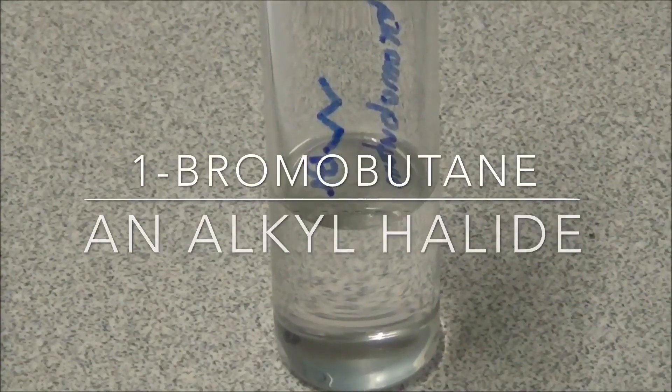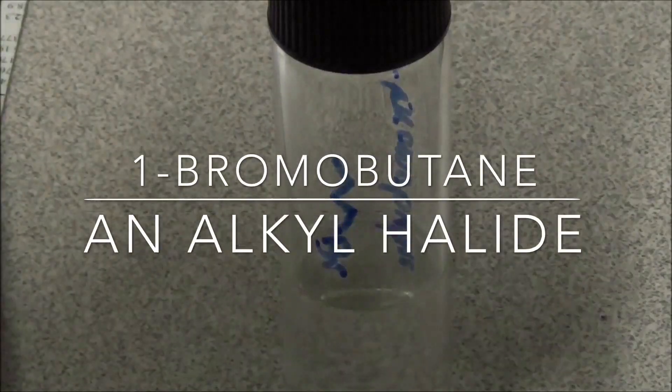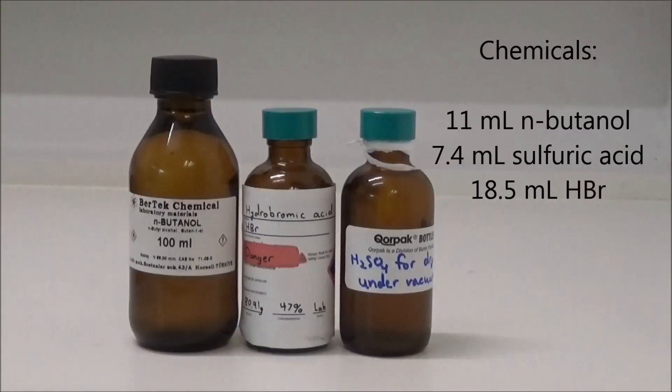Hello everyone and welcome back to the lab. In this video I'll be preparing 1-bromobutane. I will use 11 milliliters of n-butanol, 7.4 milliliters of concentrated sulfuric acid, and 17.5 milliliters of concentrated hydrobromic acid.